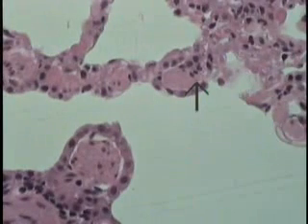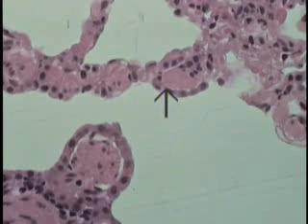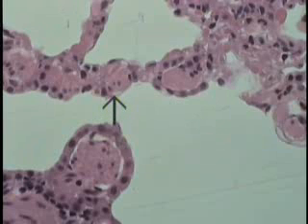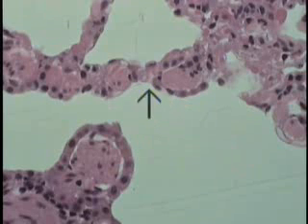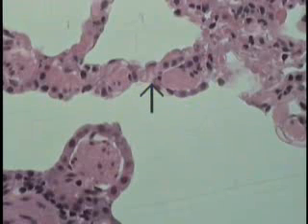And one can make out over this particular cross-sectional profile of the spiraling muscle, in between the muscle masses, one can see the epithelial lining changes from this cuboidal to this little area right here. This little fine line is the combination of an endothelial cell and a type 1 pneumocyte. This is the thinness we're talking about. So this is probably, though it's not well represented here, an alveolus here.